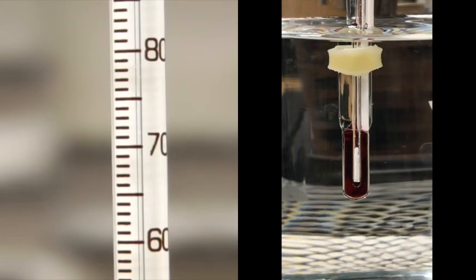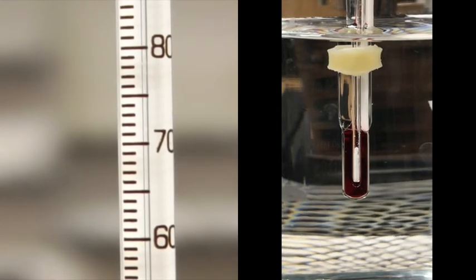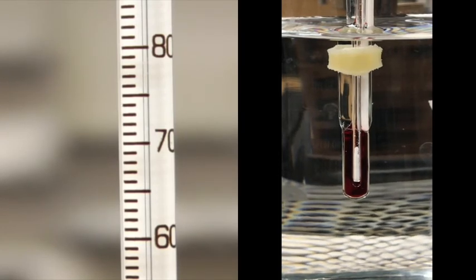All right, we're above 50 now, so about 53, 54, so we should see it come into the camera in a bit. 55.